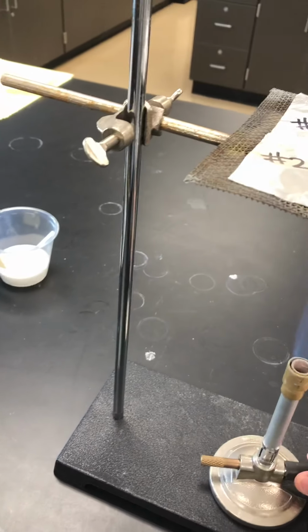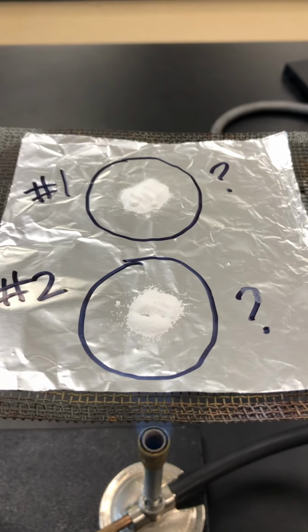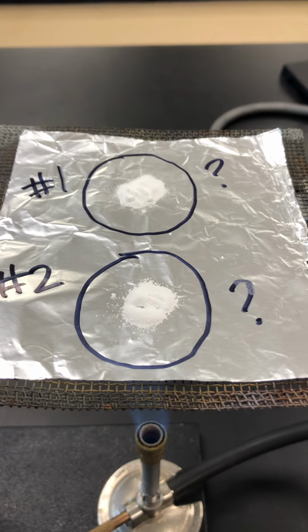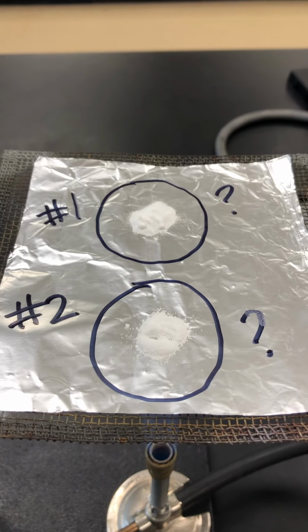Again, I should only need to wait about 30 seconds to a minute to see if they melt, and then I can record that in the data table. So these are unknowns 1 and 2.